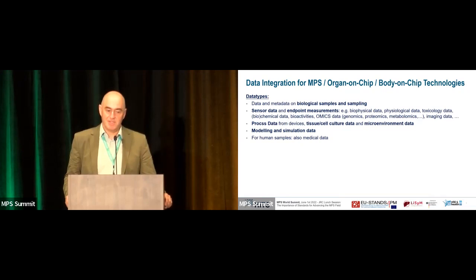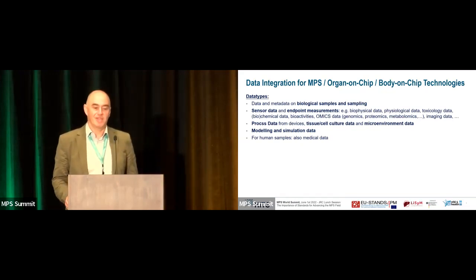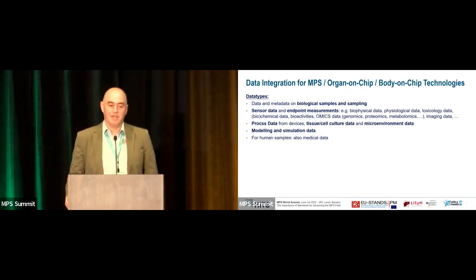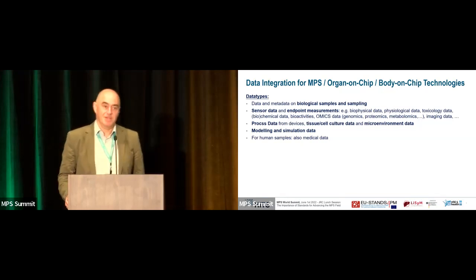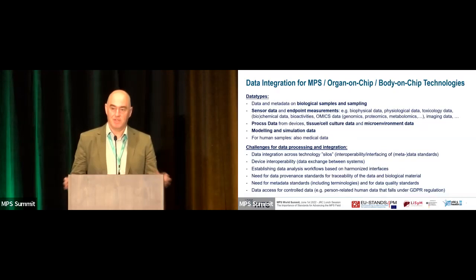And then you have the process data from the devices, the tissue or cell culture data, microenvironment data, and the like. And when you couple that to the modeling, computational modeling, you have also the modeling and simulation data. And when you use human samples, medical data also comes into play. So you have a whole range of data that needs to be standardized in order to fit to each other.